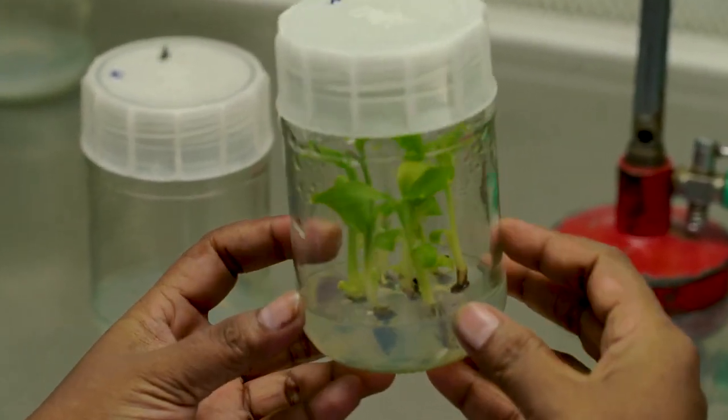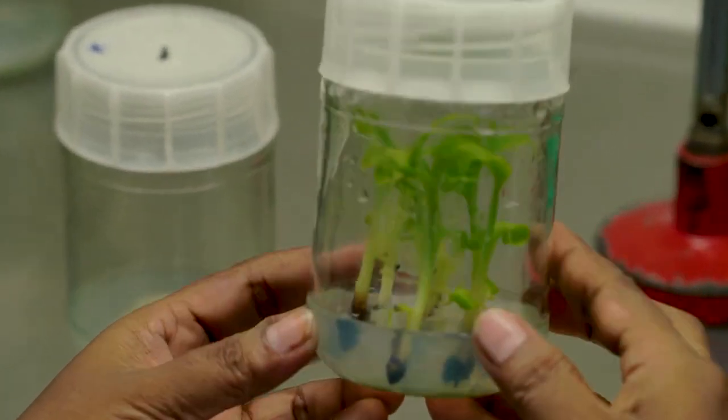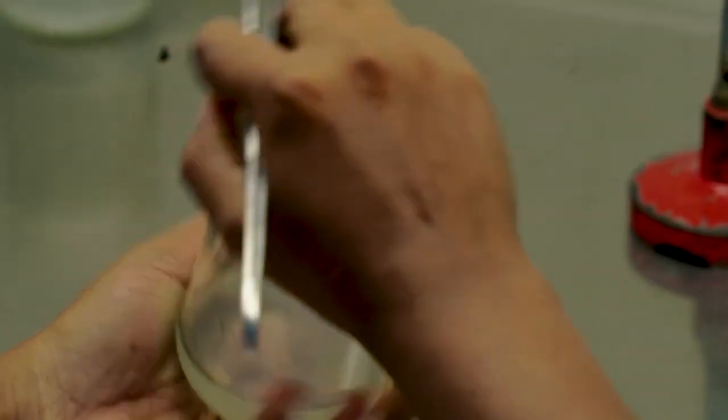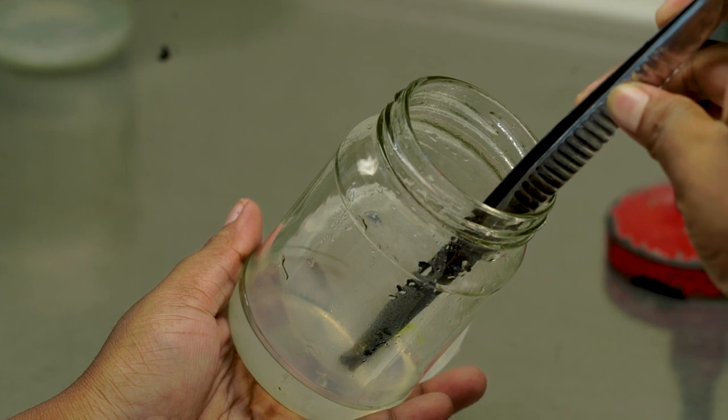Micropropagation is the process of multiplication of clonal plants through an asexual method. As you can see here, this is the process of multiplication. The smaller shoots are transferred into fresh multiplication media. This multiplication media helps in multiplying the shoots.